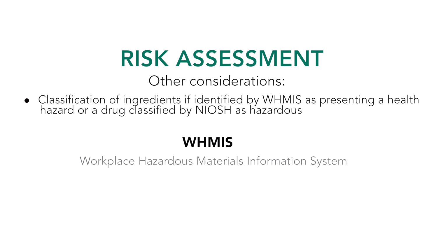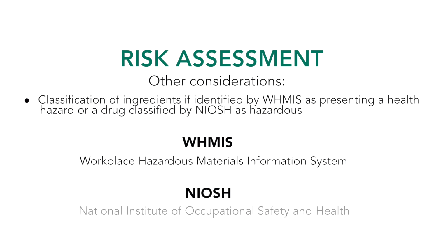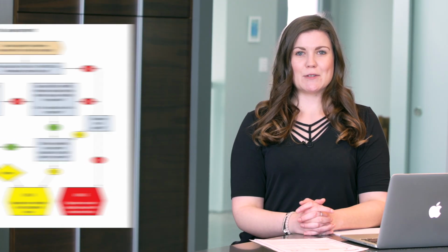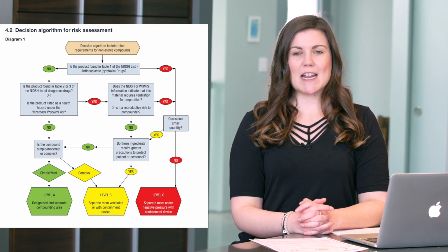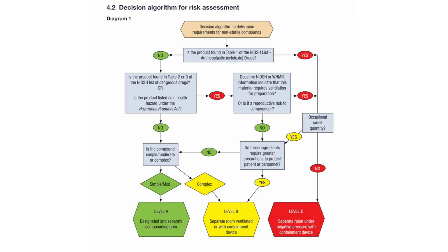WHMIS stands for the Workplace Hazardous Materials Information System, and NIOSH stands for the National Institute of Occupational Safety and Health. To illustrate the use of this map, we will be conducting a risk assessment for methadone, demonstrating how it is determined that methadone must be compounded under Level B requirements. On that note, let's begin.